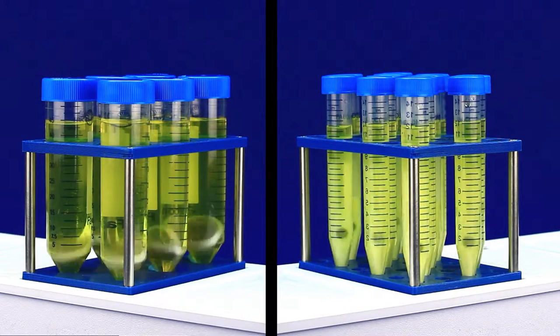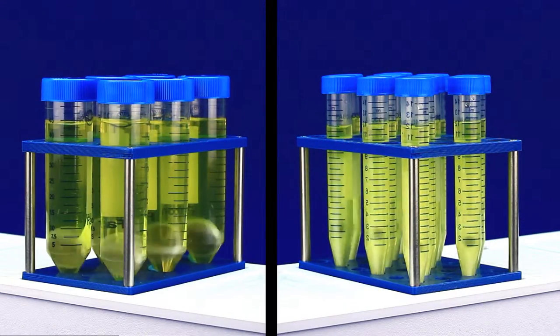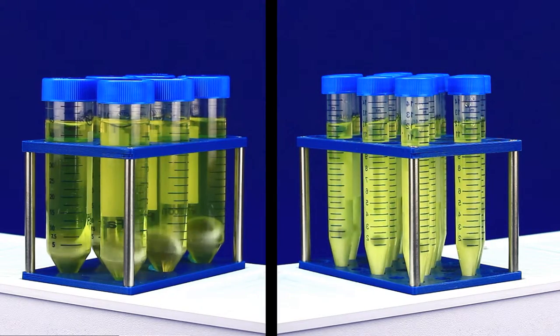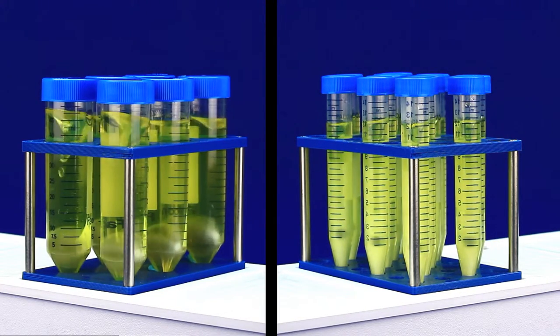Here you can see stir discs in the 50ml tubes, and our tuning fork stirrers in our 15ml tubes. Both create a strong vortex to make sure your samples are adequately mixed.